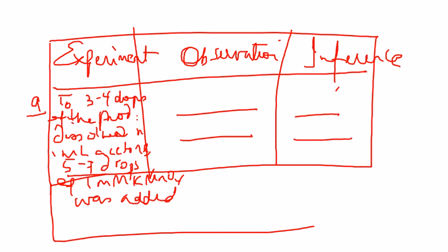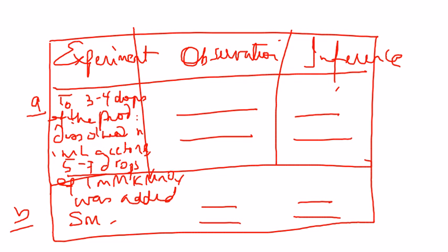And then you do the same thing for the starting material. You write a similar statement. You make the observation, you infer that, and then you discuss that in the conclusion section. So you have to discuss all 4: the percent yield, the chemical test, the IR, as well as GC. And how successful your reaction was really is a combination of everything.